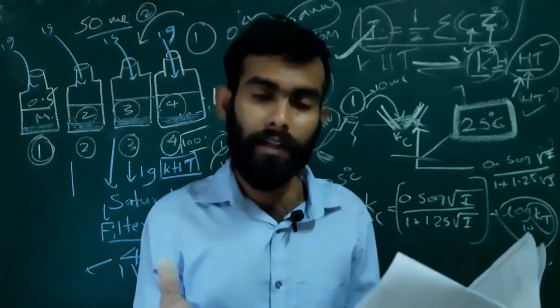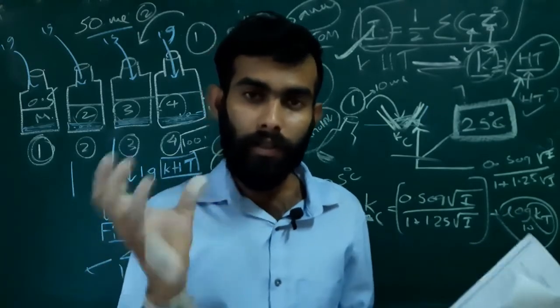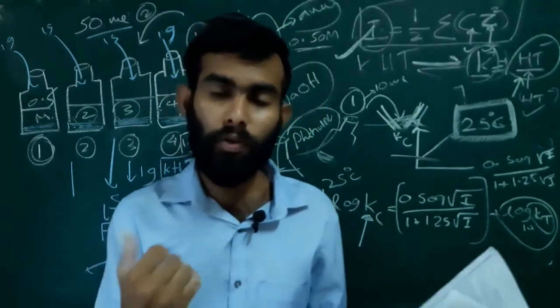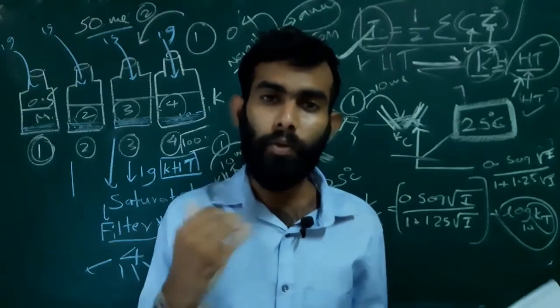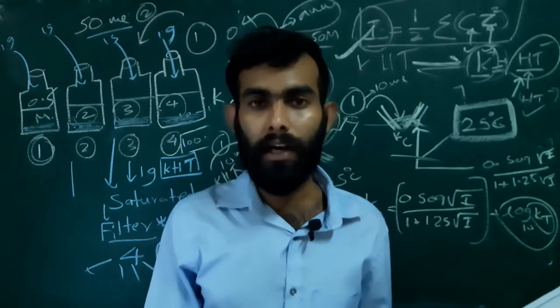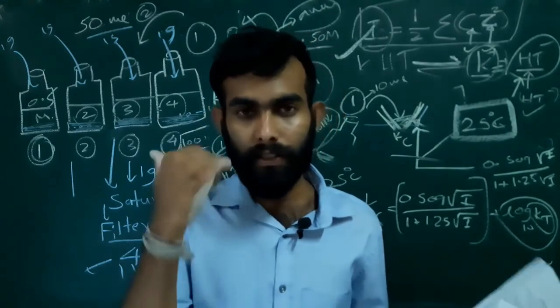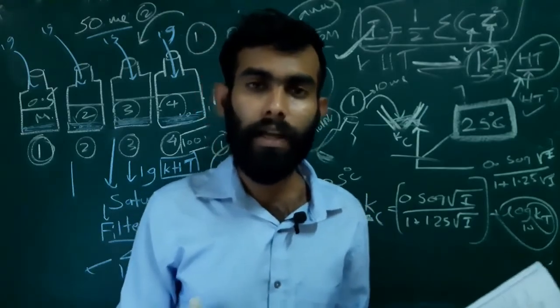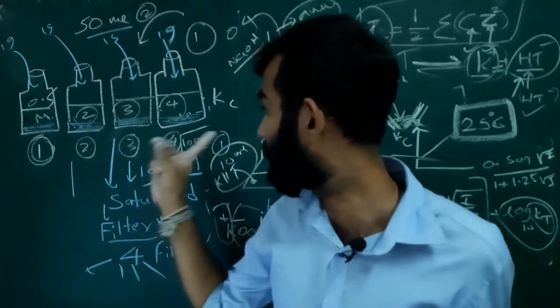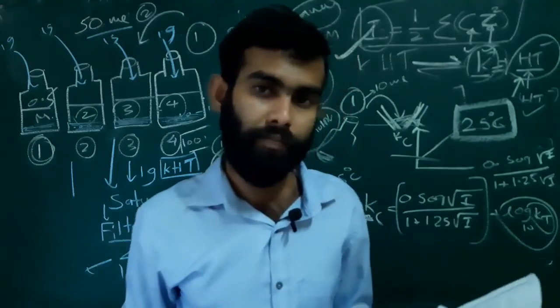We have to maintain the temperature by using a water bath containing ice cubes. At 25 we have to swirl very well. So we have to stir this water bath very well also, to achieve a homogeneous, uniform temperature. So how can we check whether our solutions have come to the appropriate temperature, 25 degrees? We have to insert thermometers into these 4 different solutions in the water bath, and check whether the temperature is 25 or not.